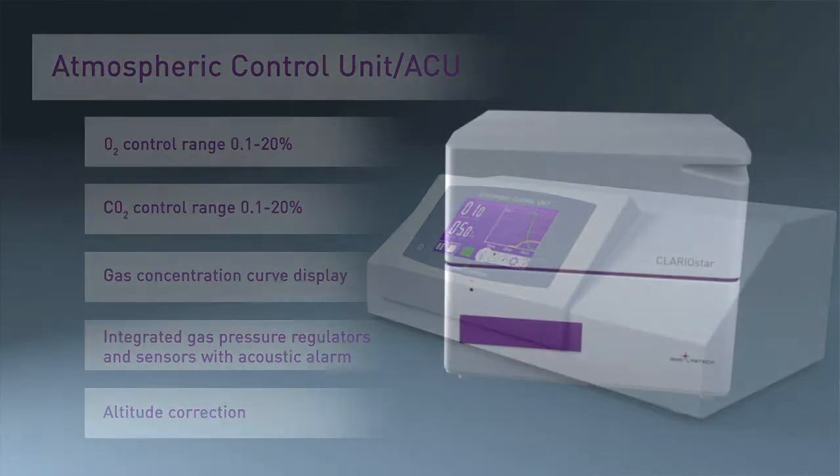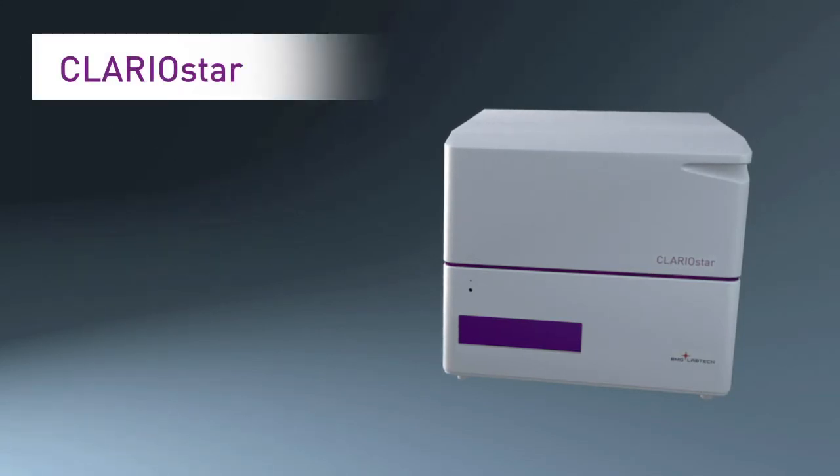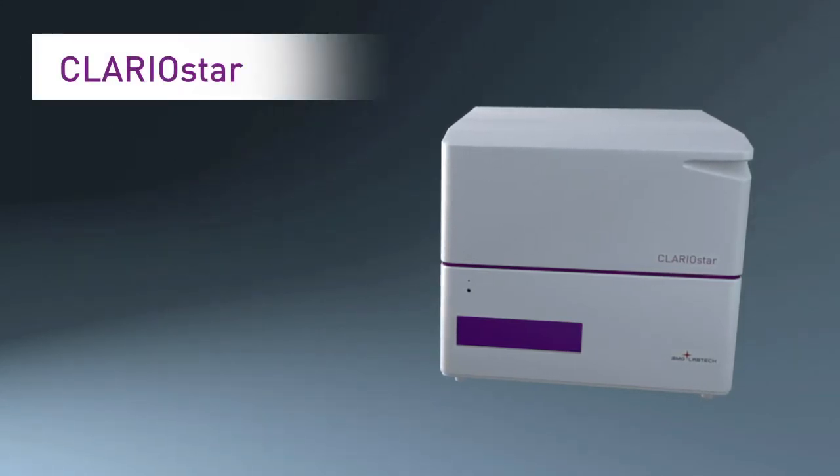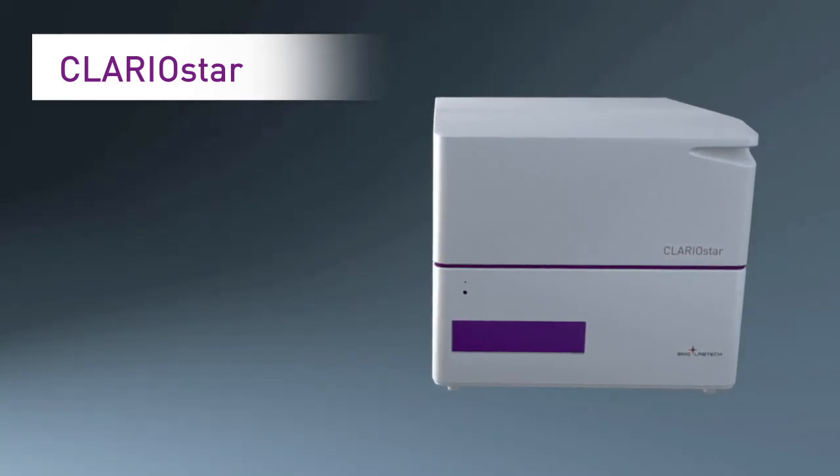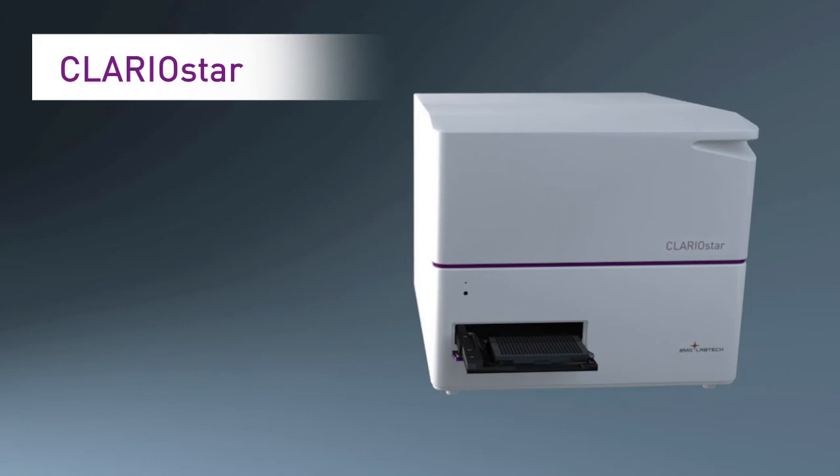Whether a lab is doing basic benchtop tests or equipping a core facility, the Clariostar works for every assay in every lab, with no compromise on speed, flexibility, or sensitivity.